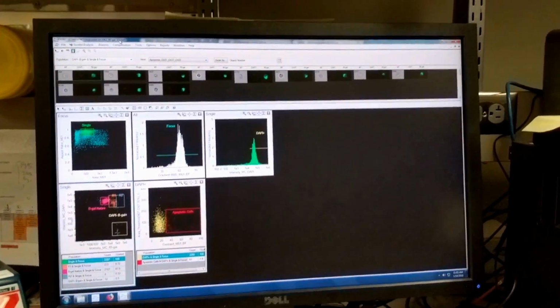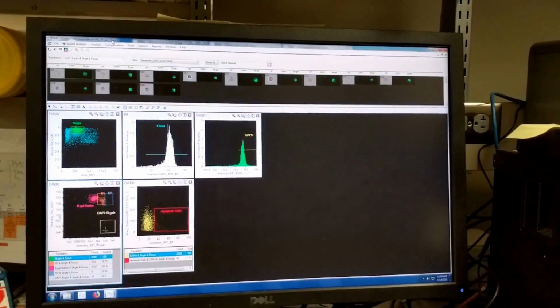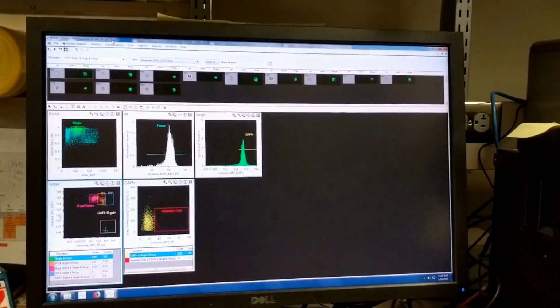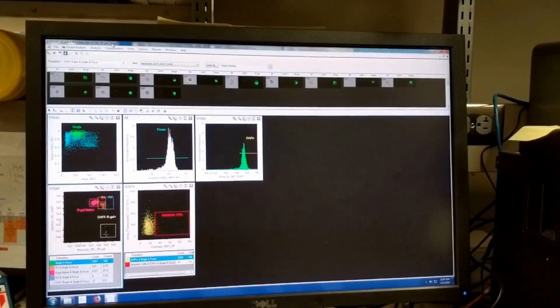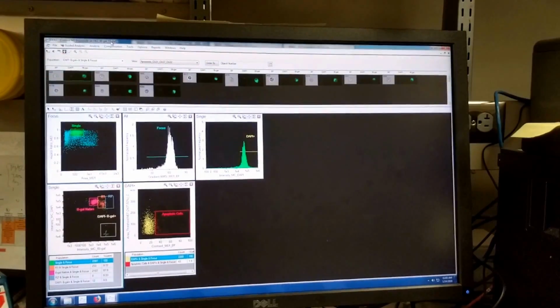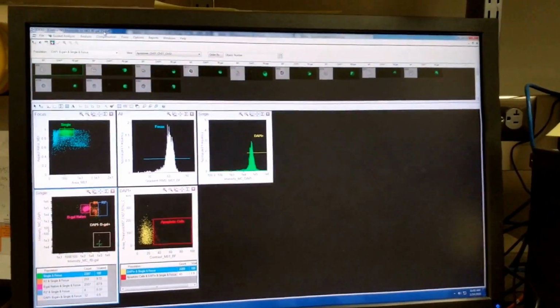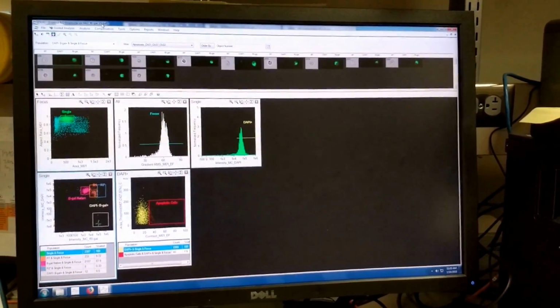So the question was, okay, if we take fluorescent beta gal and if we induce the HK2 cells with etoposide, does the fluorescence of beta gal go up, and can we use HK2 cells then to do a dose response curve? So this was a start experiment.